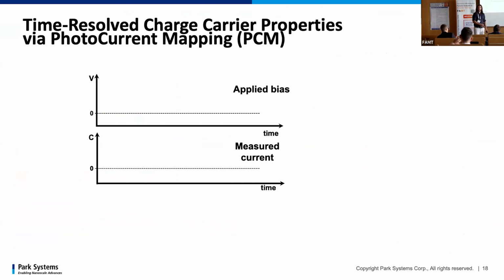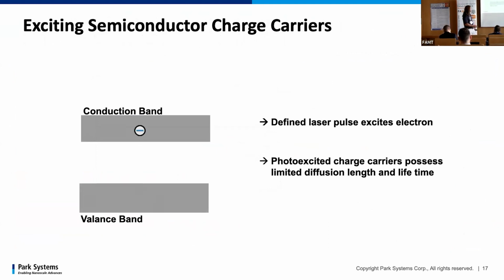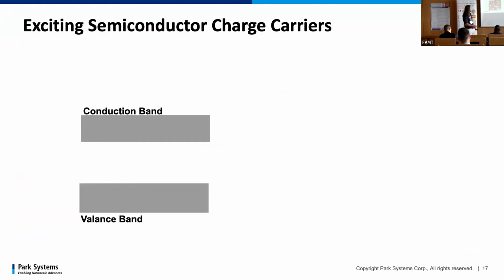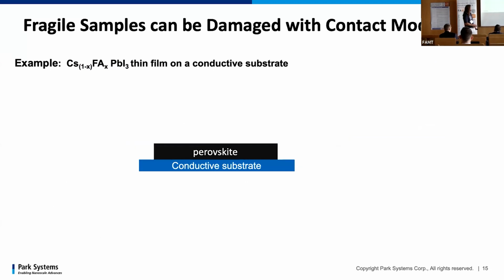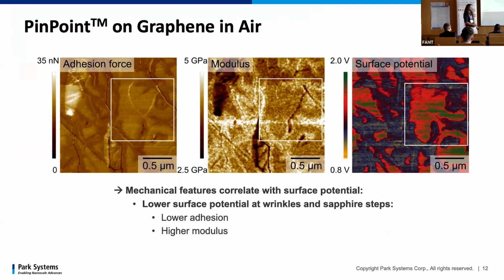You had these correlations between different types of maps. I was wondering how surprising that is to you, given that you're using the same data to infer all these different maps. And I guess you would probably have very different noise levels on these different images, depending on the model, on the equations that you use, your single model.